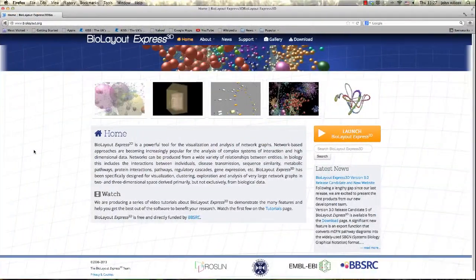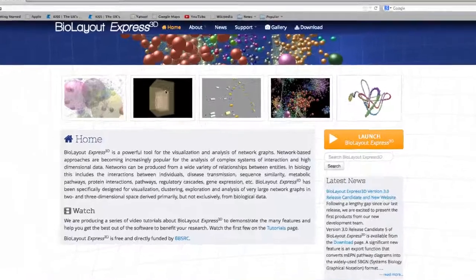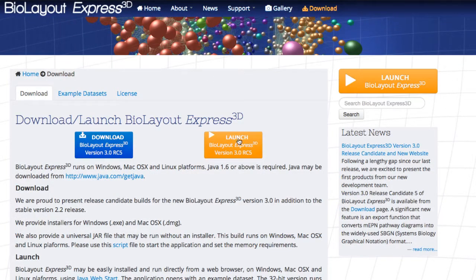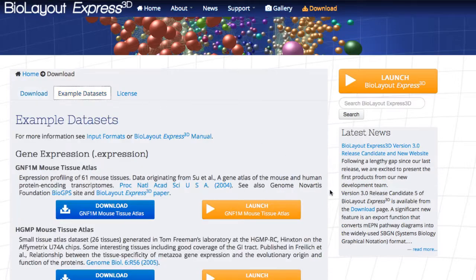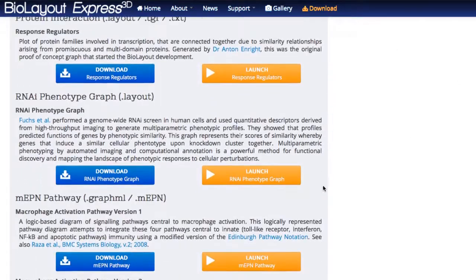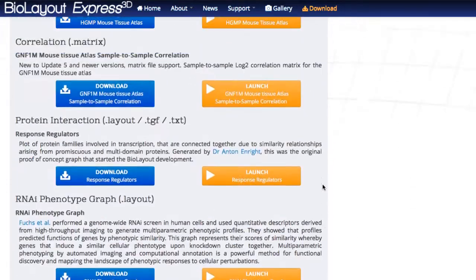We can run BioLayout from the website. Here in the Downloads section, choose either Download or Launch the WebStart version. Also in the Downloads is the Example Datasets. Here we can download or launch various graphs in their file extensions.